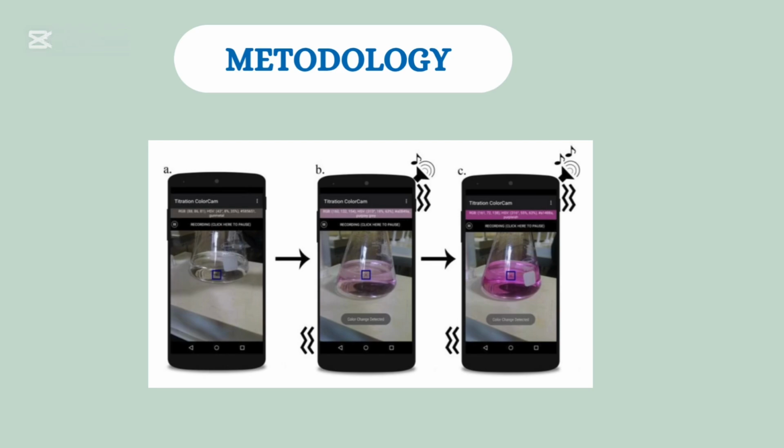In the following images extracted from the article, we can observe progressively how the app works during the titration process. Figure 1a shows the initial interface of the app before starting the titration. The camera is focused, but the characteristic color of the endpoint is not yet detected.